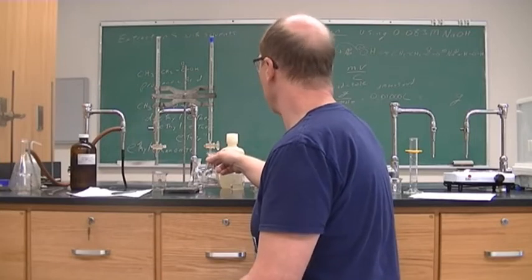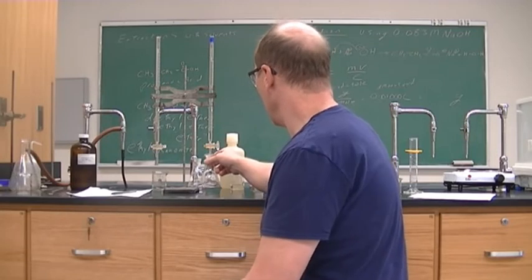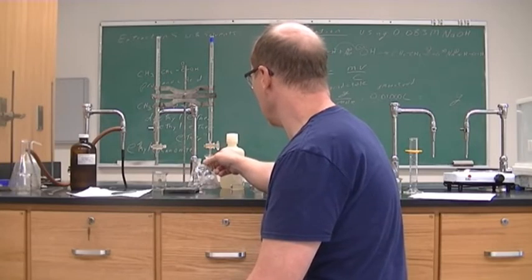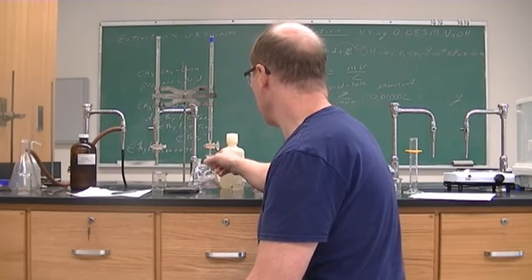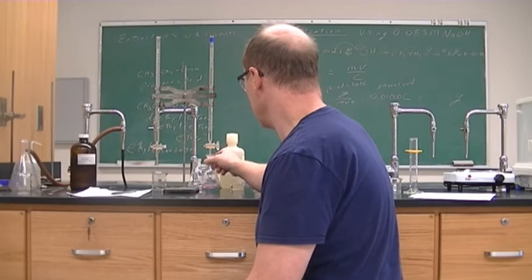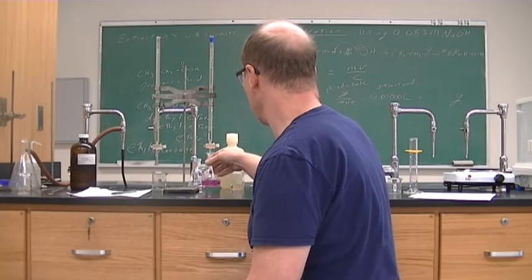It can go in pretty quickly. When the pink lingers, we will slow it down. Right now, as soon as it hits, it turns pink and disappears. Now we're getting to where it's going to stay pink.